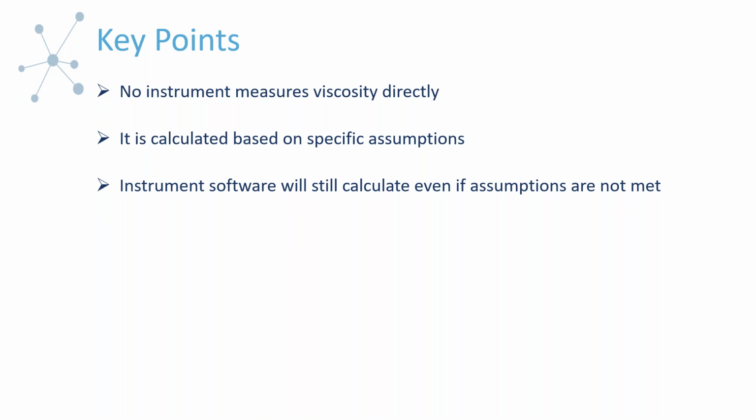Now, there are some exceptions to this. Software will stop the measurement if, for example, you're in the danger zone, and by that I mean you're potentially going to overload or overpressure the instrumentation. But otherwise it will continue going. I don't say this to intimidate anyone or make you think that this is a difficult or challenging measurement. As you'll see in a few moments, you just want to be aware of this, because it's going to be important if you want to generate good data moving forward.